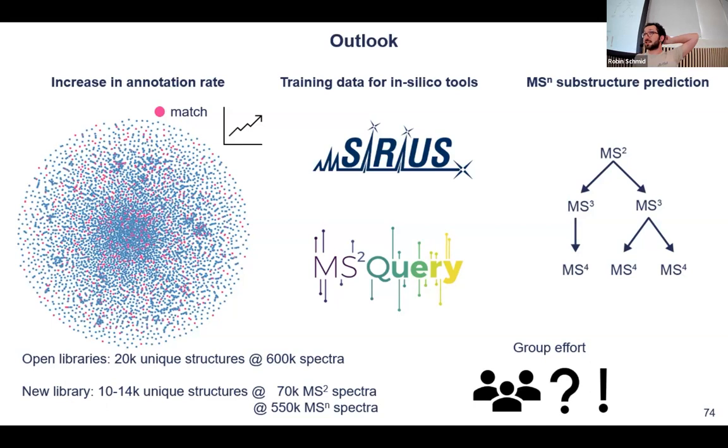So the question was, if we merge spectra, what kind of scores that gives, I guess, against spectral library matching and maybe SIRIUS prediction and so on. The thing is, there's no standard way of merging spectra. Some people sum them up, some people use the maximum intensity across the scans, because then at least you retain the amplitude.